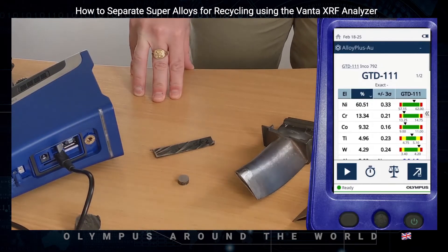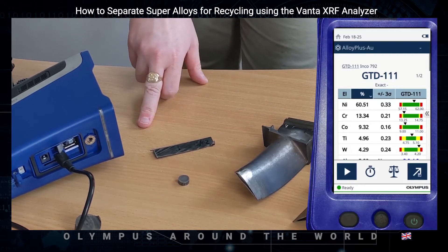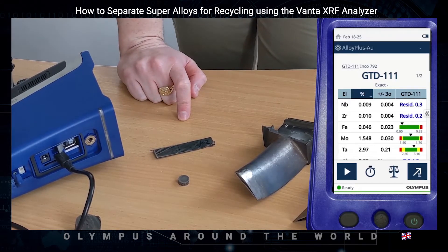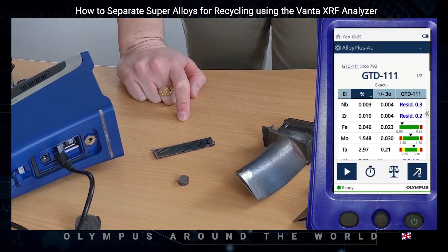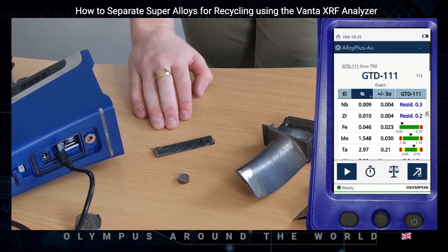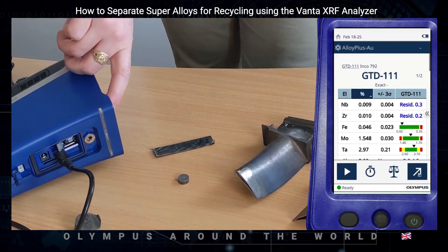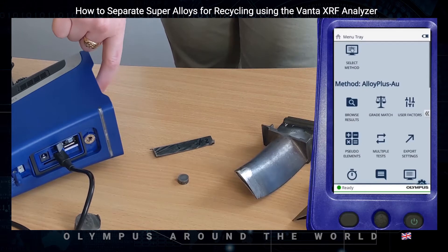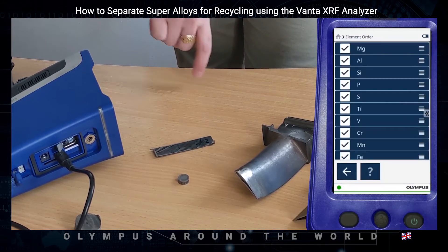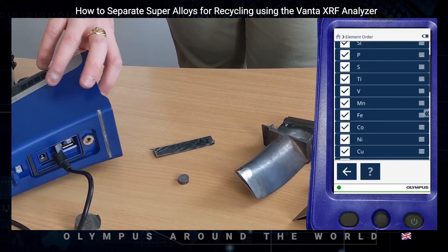We can also reorder the elements on the display simply by pressing the column headers. So if we wanted the lowest element concentration at the top, we can have that. You can also customise them to have important elements shown. The easiest way to do this is to go into the main menu, scroll down to element order, and then click and move specific elements to wherever you choose.